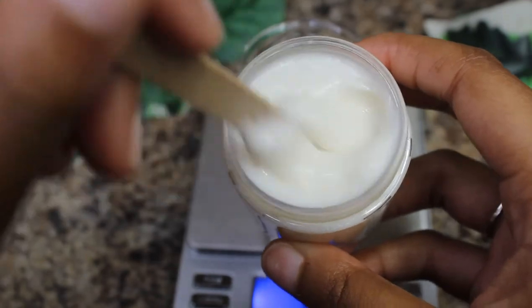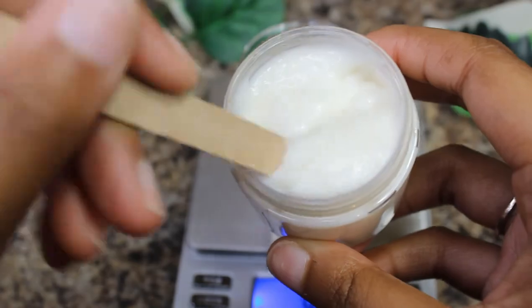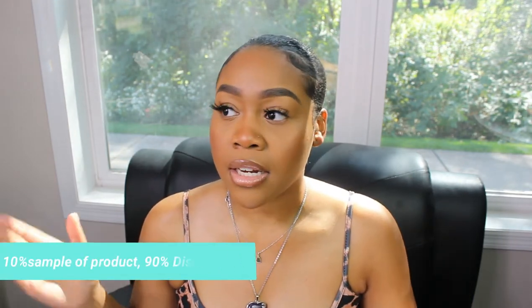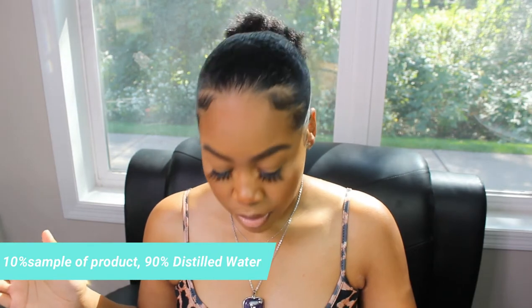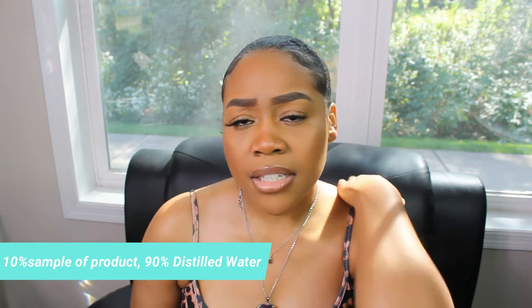Always take a sample and never use the main beaker with all of your product to check your pH. Please do not use your whole formulation — take about one to five grams, or use 10% of your sample and 90% distilled water to check your product's pH.